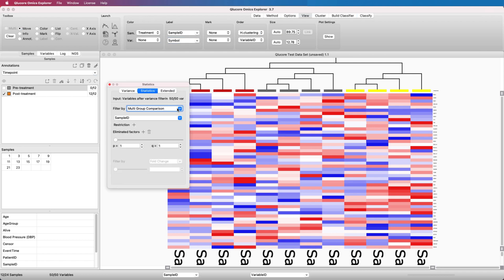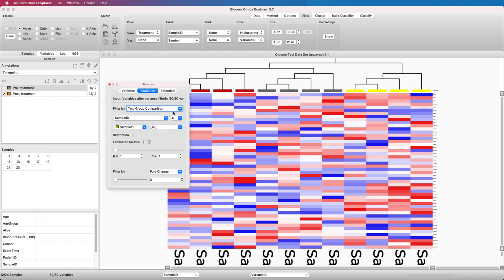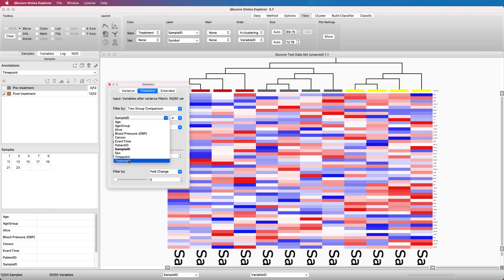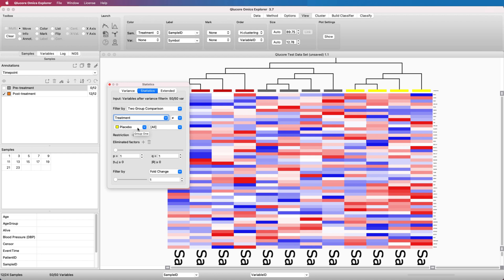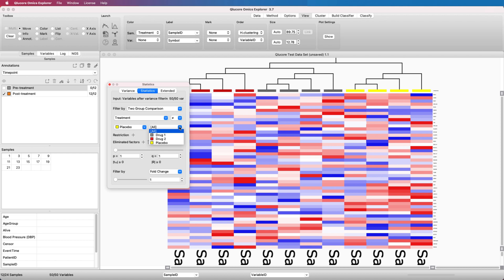Select two group comparisons in the Statistics window, and then select the Annotation Treatment Test and the group Placebo to identify the variables that discriminate the placebo group from the other two groups. Let the other value remain as all, meaning that the placebo group is compared with all the rest of the samples, both Drug 1 and Drug 2 treated as one group.